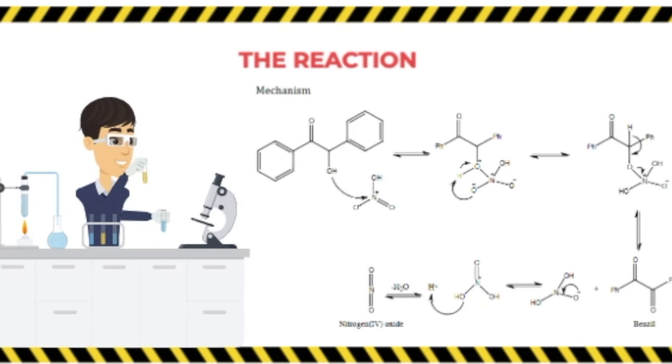So now I'm going to jump into the next portion of the video, which is going to showcase how we are going to do the same reaction, but in a more environmentally friendly method to reduce the amount of waste, to drive the reaction at a faster rate, which is actually only going to take 2 hours instead of this method, which took us around 3 to 4 hours. And it also produced more of the desired compound Benzil. So let's go ahead and take a look.